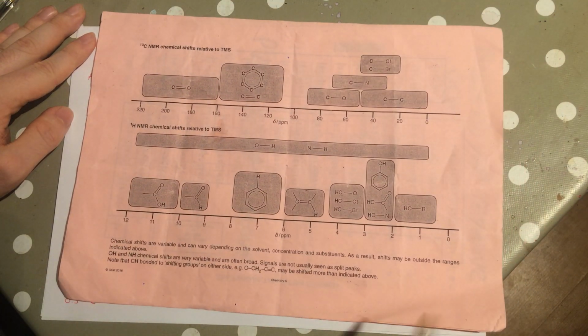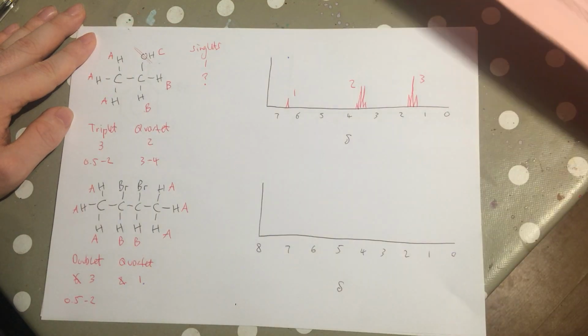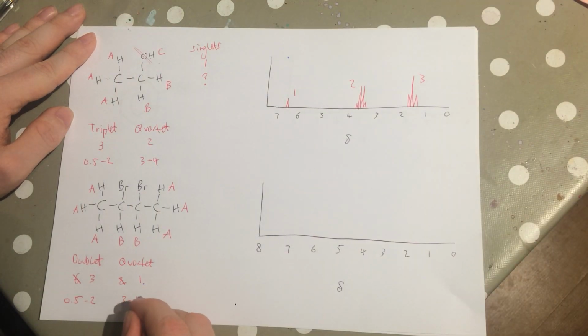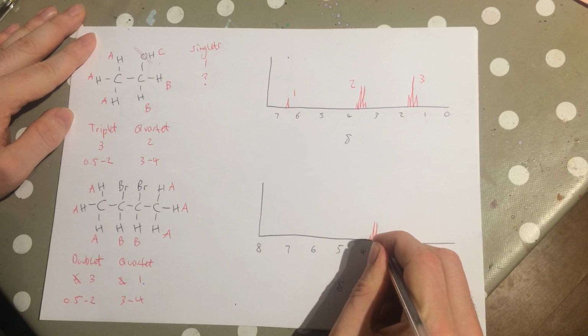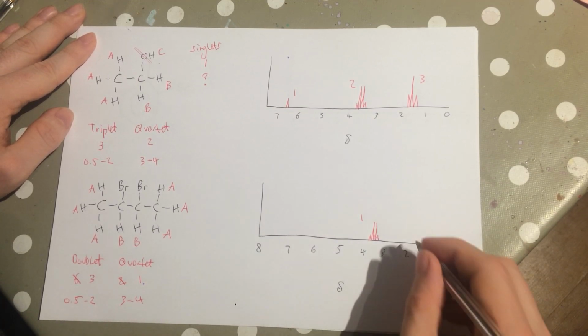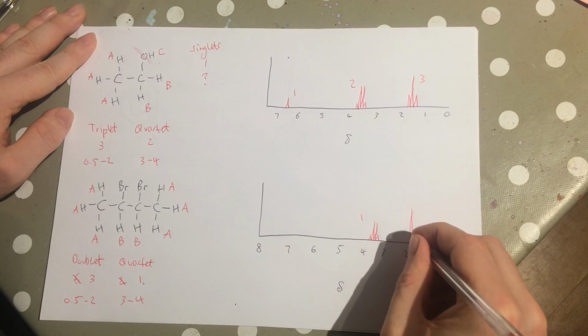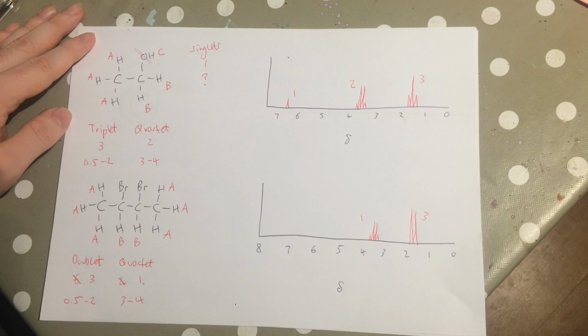Again, if we look in our data sheet, we can see that's between 3 and 4. So what will that look like? Between 3 and 4, we'll have a very small quartet. And between 0.5 and 2, we'll have a fairly large doublet. Okay.